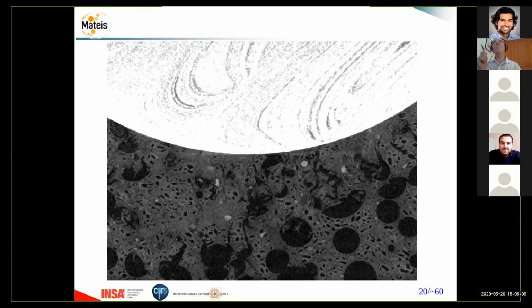Well, the number doesn't matter, I think. It only depends on what is the maximal depth that you want to reach. What is more important is the distance between each step, because this is controlling your capacity to make the correlation after the test.